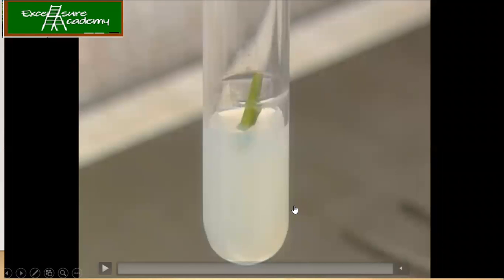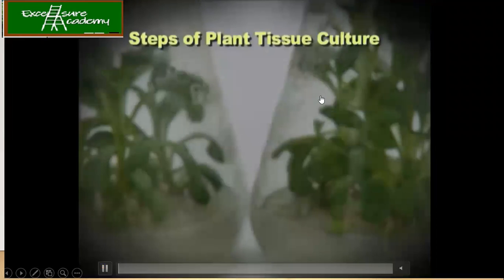So now this is the video. I'm going to explain as the video is progressing so that you can understand how exactly plant tissue culture is being done. So let's watch the video, and I'll also be saying what exactly is happening. So yes, you can see the steps of plant tissue culture. So let's talk about these steps.